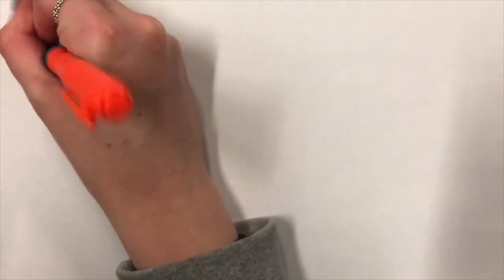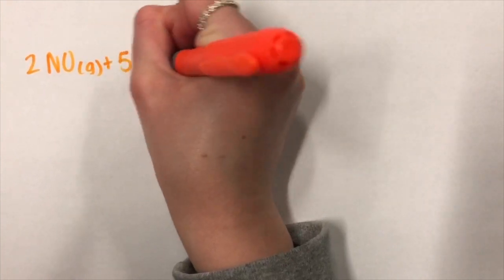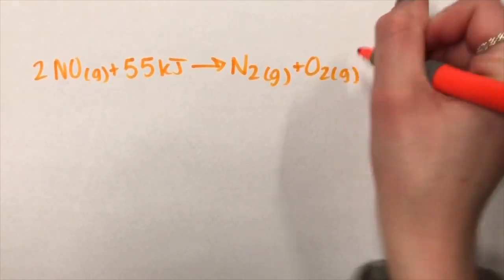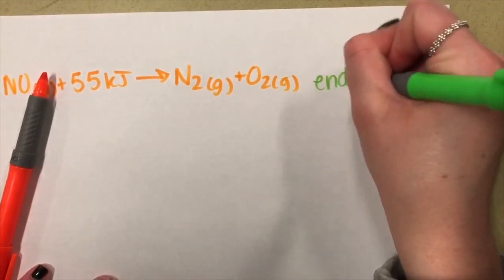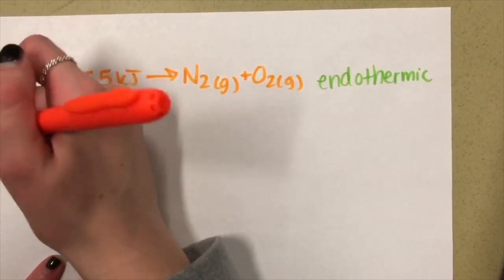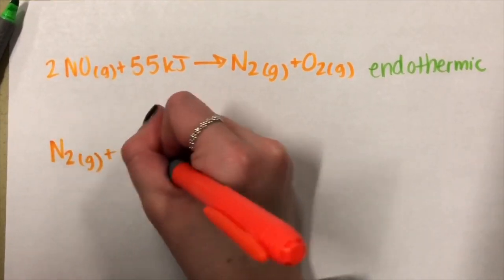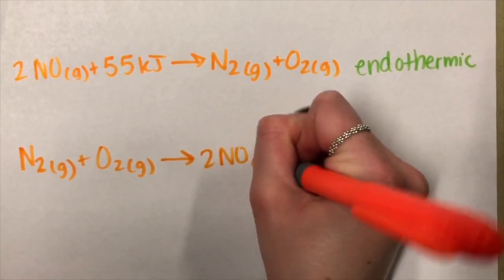Heat, or thermal energy, is an important factor in many facets of chemistry. In reactions specifically, heat can either be necessary for the reaction to occur, this type of reaction is defined as endothermic, or the reaction itself can give off heat, this type of reaction is exothermic. The heat produced or used by reactions varies greatly depending on the substances involved and the process by which the reaction is facilitated. In a reaction, if the temperature change and specific heat capacity are known, the heat of reaction, or enthalpy, can be determined.